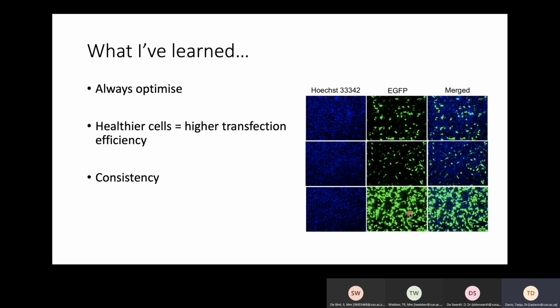So they might end up moving the plasmid into some kind of vesicle, which can lead to degrading the plasmid, which can also decrease your signal. But in most cases, the signal intensity should be quite good, and it should be what is normally expected from that fluorescent molecule.